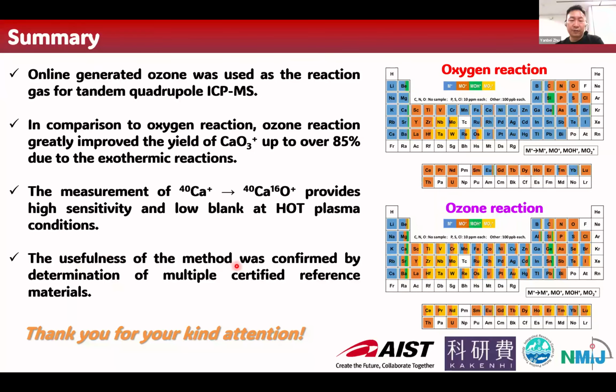The usefulness of the method was confirmed by determination of multiple certified reference materials. And we also compared the differences between the ozone reaction and the oxygen reaction. We are also carrying out research on other elements now.